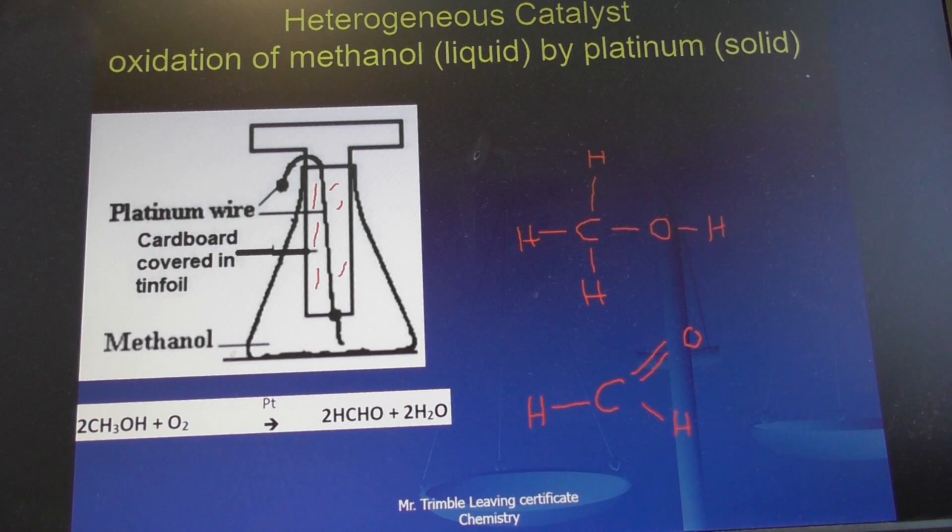The glowing platinum metal will pop for a little while and then will stop glowing and the popping will stop. That has to do with the presence of a catalytic poison, which we mentioned before. It blocks or inhibits the catalyst. In this case, the catalytic poison is actually carbon monoxide.